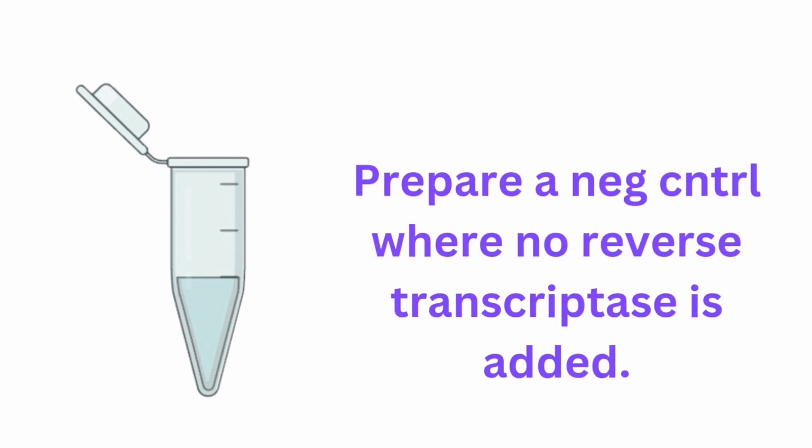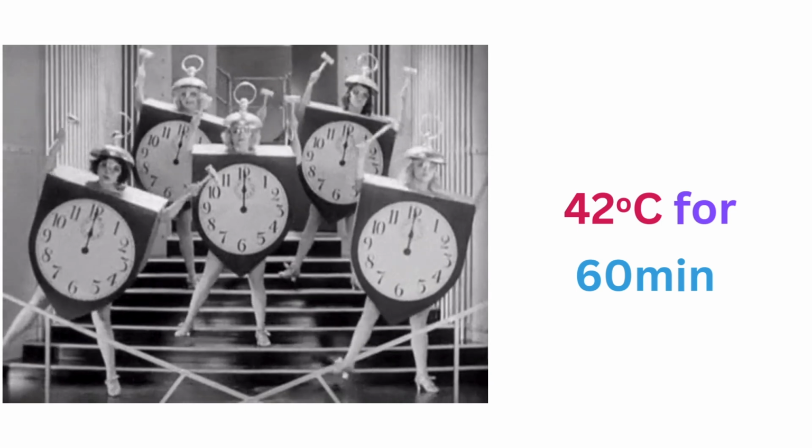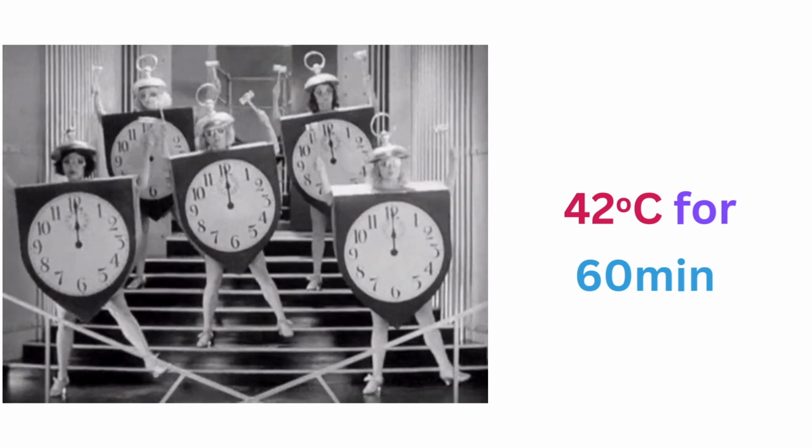To check that the reaction is specific, we also do a negative control. This is where we've got the RNA, we've got the reaction mix, but we don't put any Moloney murine leukemia virus reverse transcriptase. We leave that one out so that we can check that our reaction is specific. Here we need to heat it up to 42 degrees, and we're going to incubate it at 42 degrees for a whole hour, for 60 minutes.